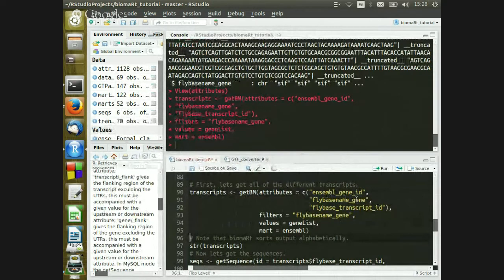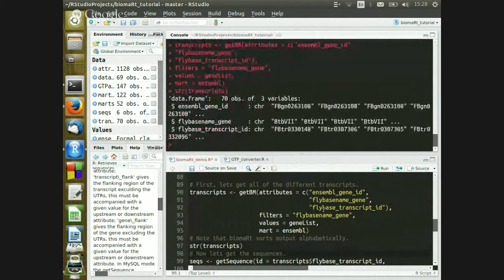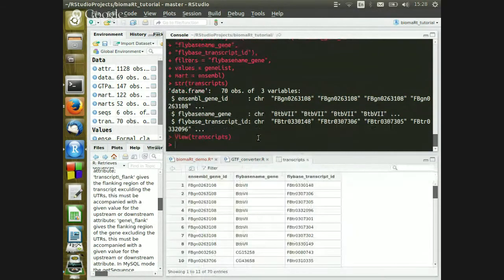And that was again extremely fast. It was working a lot more slowly when I did the search line. Anyhow, we got a list of ensemble gene IDs, gene names, and also now you'll notice that we have different transcript IDs. If we click on it here, you'll notice that there are multiple transcript IDs for every gene name, one per transcript that the gene has.